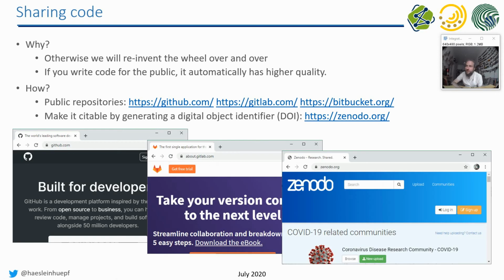Furthermore, a word about sharing code. You have developed during this semester a couple of times a workflow where you do some pre-processing, then you do thresholding, and then afterwards you do some connected components analysis and measurements. These workflows have been developed a billion times over the years, and we are developing them again and again. We are reinventing the wheel again and again because our community has a bit of an issue with sharing.